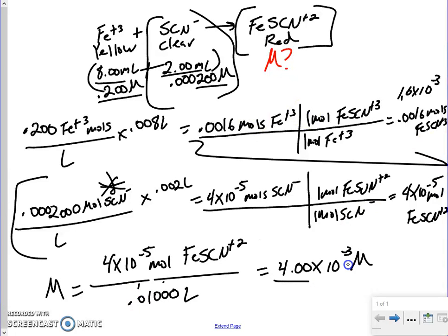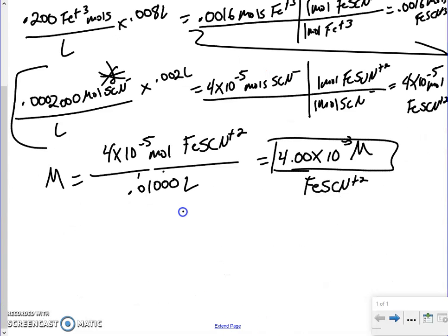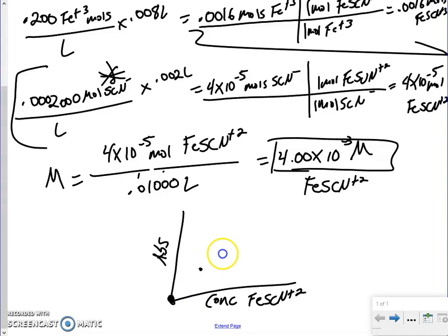So once we have our molarity for each one of our reference solutions, so you'll do this 5 times, once for each reference solution, you'll get your molarity of the iron thiocyanate ion, and you will create your graph of those concentrations, those molarities of the iron thiocyanate, against the absorbances you collected. Okay, and 0, 0 does need to be one of them, don't forget that. And then you should have your other 5 references, whatever they are. You're going to graph those with Excel instead of using your hand, hence the reason that looks awful. And you're going to get your y equals mx plus b.